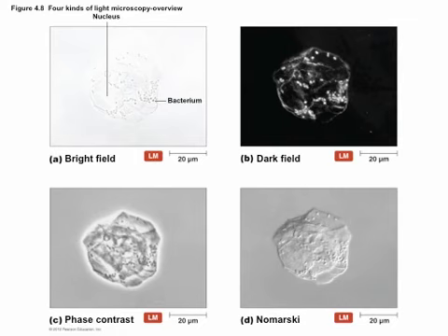Just to give you some pictures here, this on the upper left is bright field microscopy of some tissue cells with some bacteria inside of them. This is dark field microscopy, and you can see that these little dense bacteria, you can now see them very, very well. They just light up. But you lose a little bit of contrast. Some of these things over here you can definitely tell are two different objects. Over here, you might have two white dots with a little white bit underneath them as well, and it's a little bit harder to tell exactly. But you can definitely see them much easier.